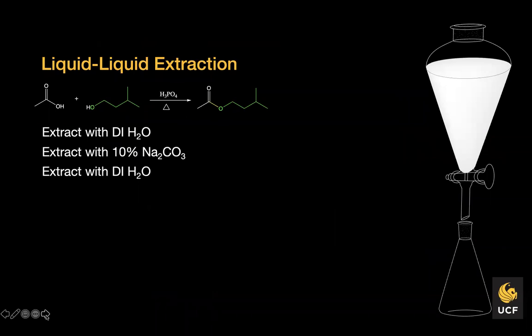Okay, so once we reflux the reaction mixture for 25 minutes, next what we did was liquid-liquid extraction. And what we really wanted to do in that step is isolate the product of interest, right? And we wanted to extract other molecules that are present in solution into a different layer, which is basically an aqueous layer in this case.